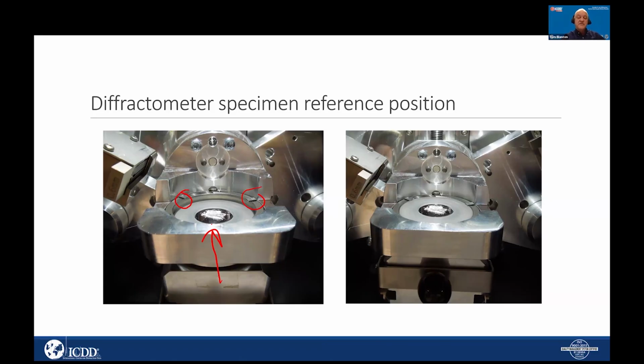And so it is that position that is the correct, we'll call it, stage position of the sample. And now you want to know, where's my actual powder relative to that? So this is a holder that has a silicon background plate in it, but the plate is actually mounted just a little bit below the sample holder plane, so that when I sprinkle powder on it, it's nominally level with the plane, so I don't create a displacement error.